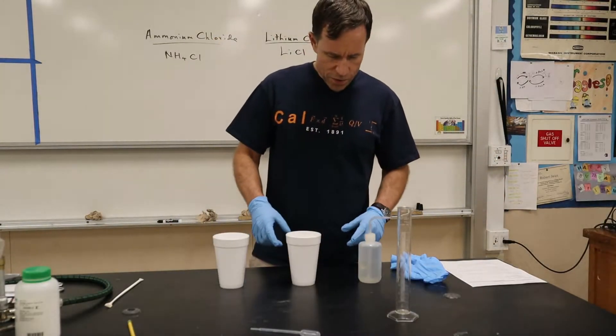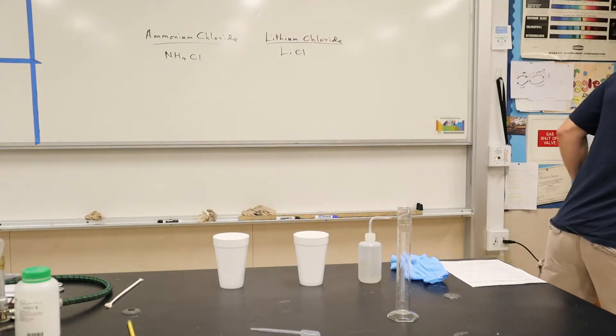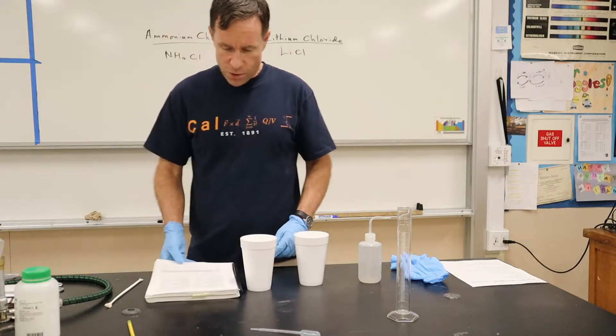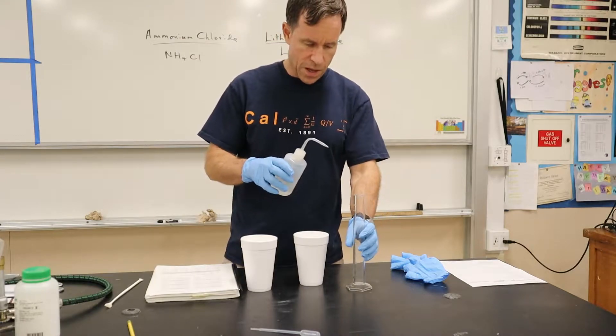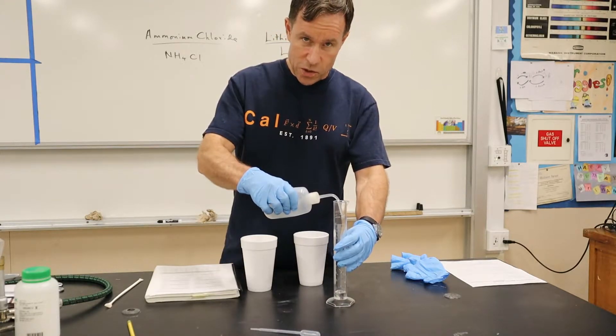So what we're going to do, according to the instructions, is take 45 milliliters of water. I've got my graduated cylinder here, and I'm going to put in 45 milliliters of water. I'm using distilled water.